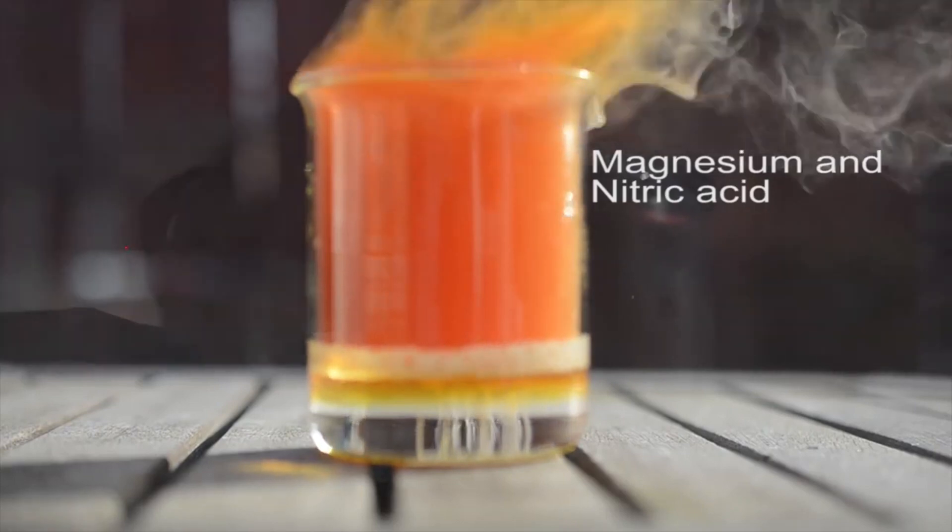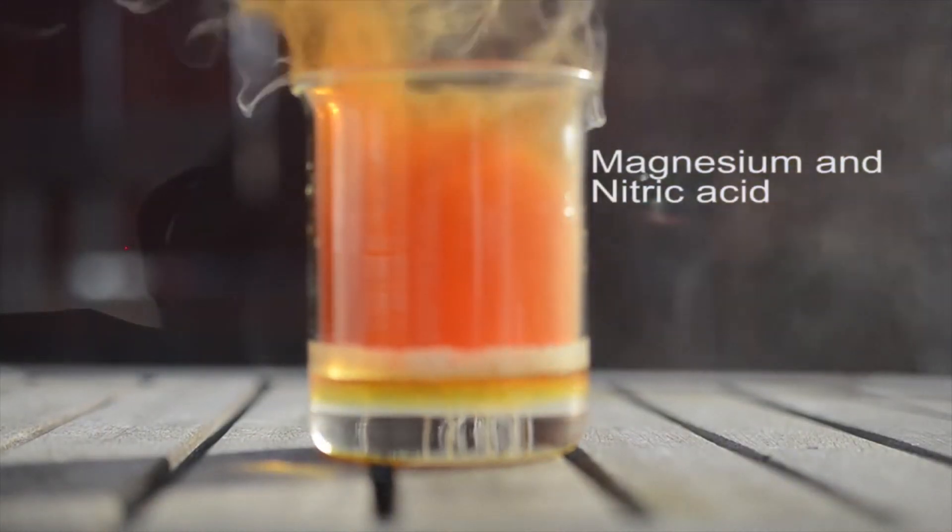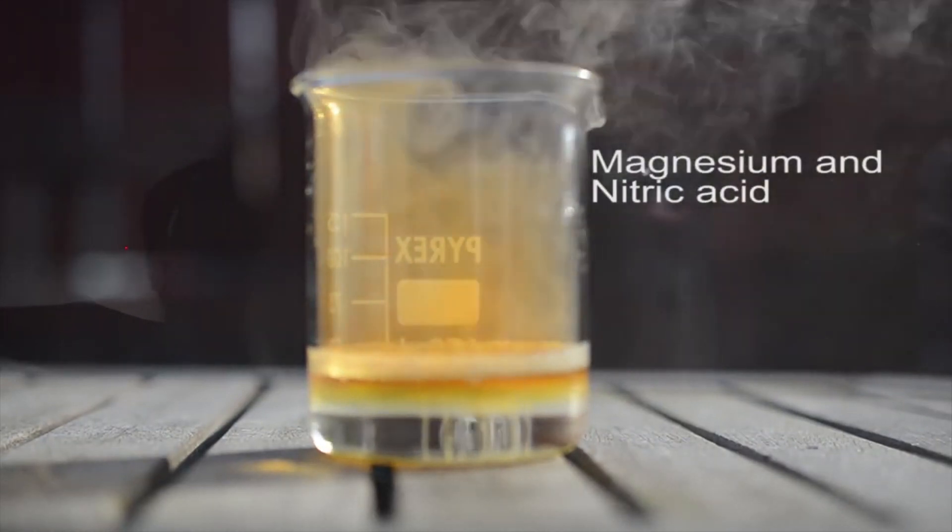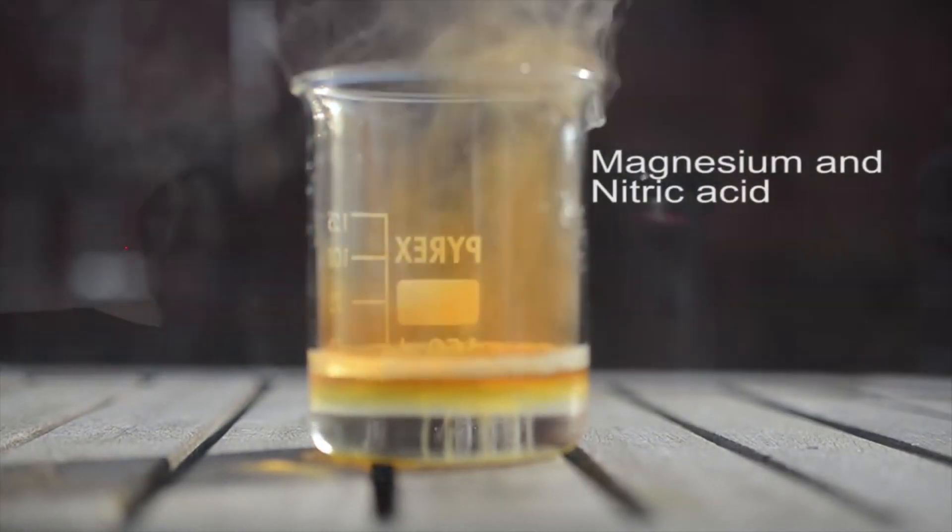Magnesium reacts with concentrated nitric acid producing nitrogen dioxide, magnesium nitrate and water. The elevated reddish brown gas is nitrogen dioxide.